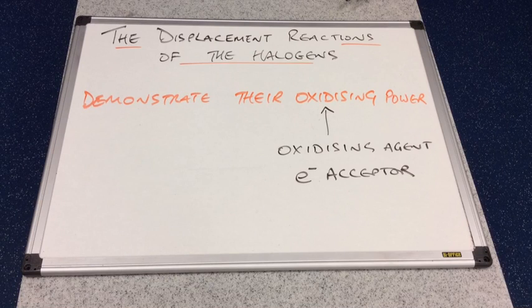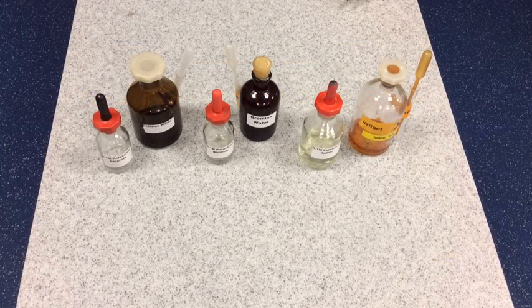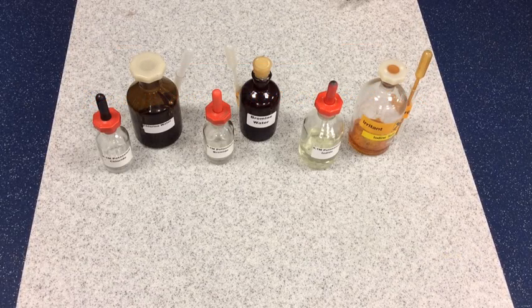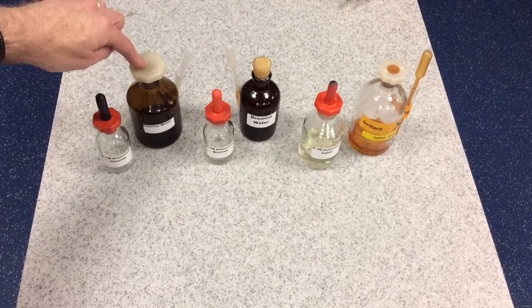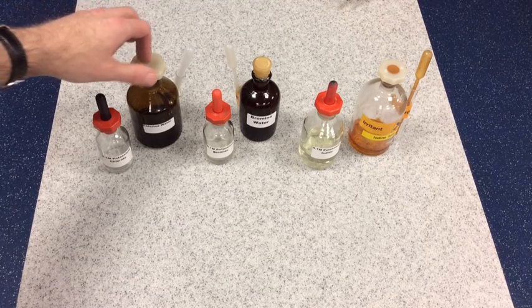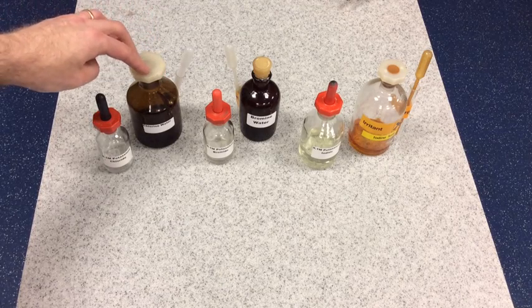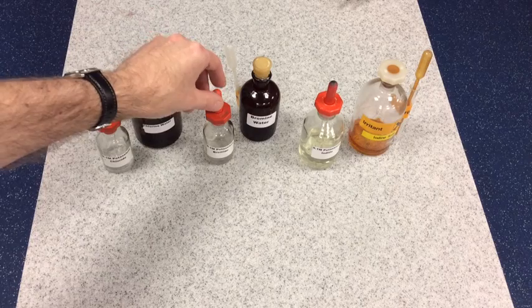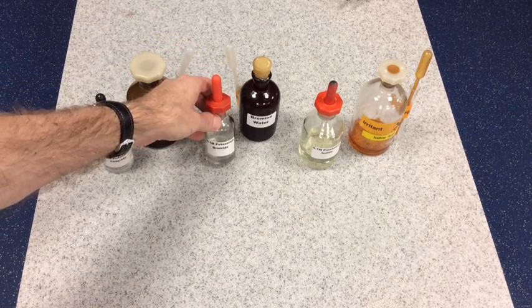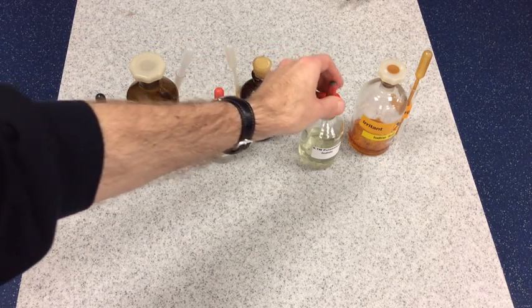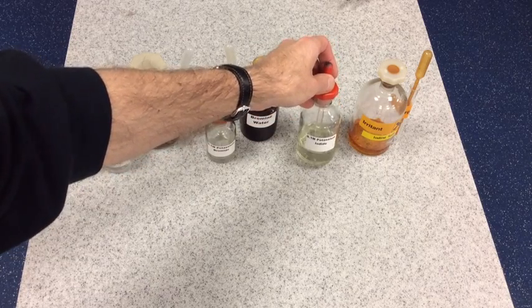Just a reminder that an oxidizing agent is an electron acceptor. In this series of reactions I'm going to video, I'm going to be taking a halogen, so this is my source of chlorine, and I'm going to react it with an aqueous halide ion. In this jar I've got bromide ions, and in this jar I've got iodide ions.